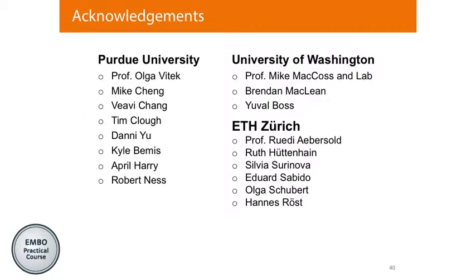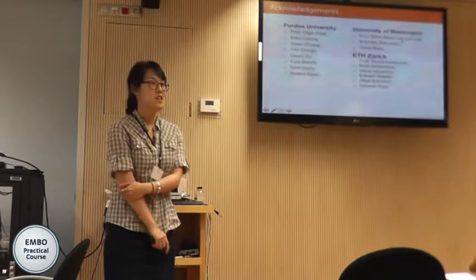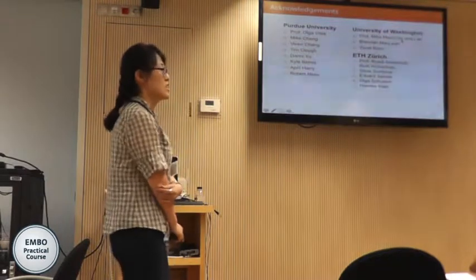Yes, and that's it. Definitely Brendan and the MacCoss lab members are some of our favorite co-workers for expanding our MSstats, and Tina, Olga, and Edward also gave really good suggestions for the future of MSstats. And yes, I'm done.